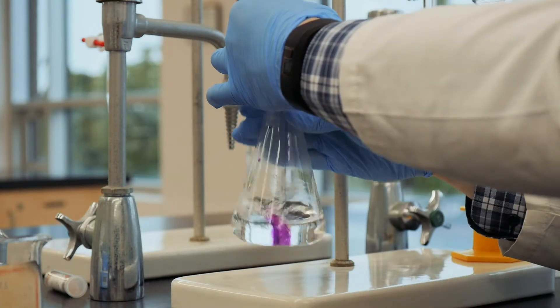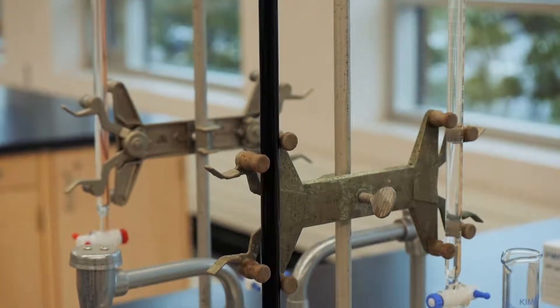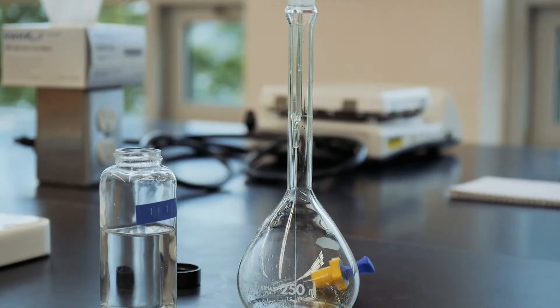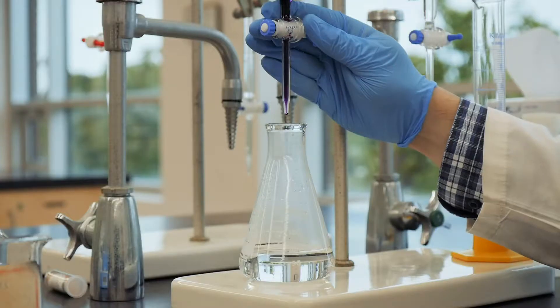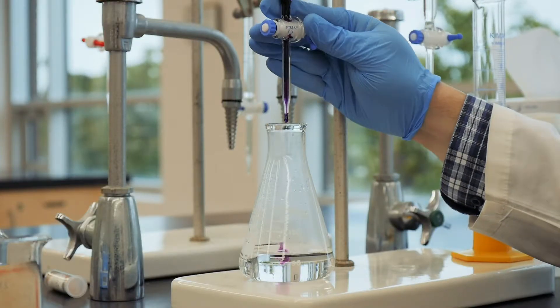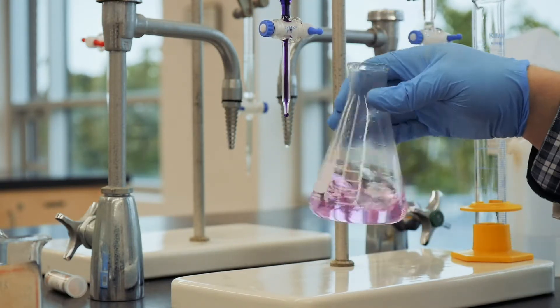You've had some practice with each, so be sure to remind yourself by checking out our videos on burettes, pipettes, and volumetric flasks. But for now, we're trying to find the unknown concentration of a solution by reacting it with a solution that we do know the concentration of. We can do this with a titration and the balanced chemical equation.